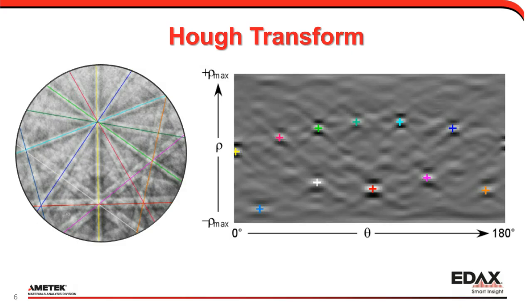So you have theta from 0 to 180, and you have the rho. Excuse me, I said that backwards. You have the rho fraction from basically inside to out, and then you have the theta from 0 to 180 degrees. This is just how we find the lines. The key thing with this is the computer actually has to be able to find these features in the Hough Transform, and these are going to be controlled by the Hough parameters. So where are these Hough parameters kept?